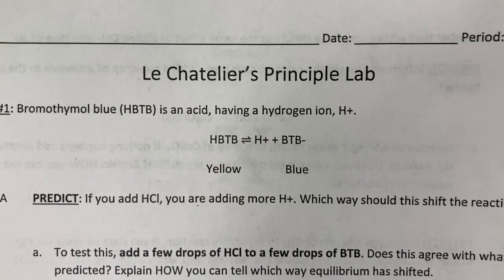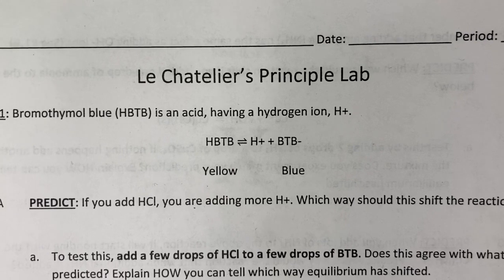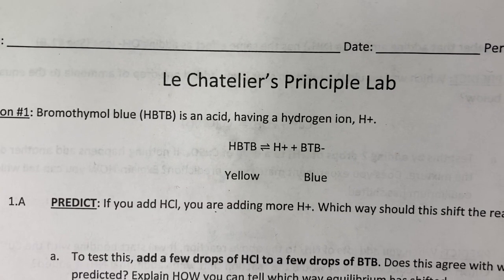Hey everyone, today we are doing Le Chatelier's Principle Lab. I'm going to be demonstrating each of the 4 reactions in this video. Before each reaction, make sure you are predicting. So knowing what you know about Le Chatelier's principle, predict which way you think equilibrium will shift, either left or right, depending on the chemicals that we're adding.